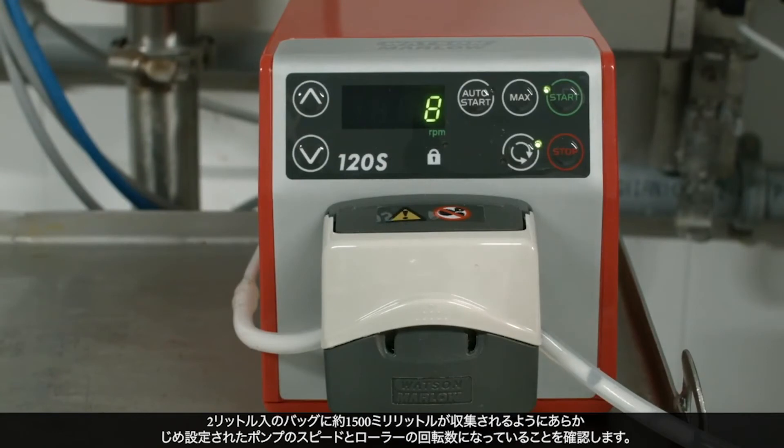Be sure the pump speed and roller rotation is set to the predetermined settings to fill a 2-liter bag to approximately 1500 milliliters.